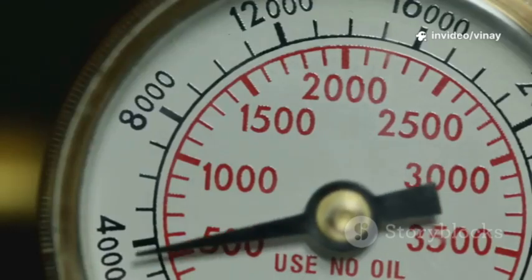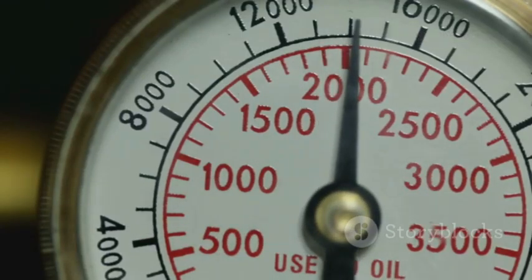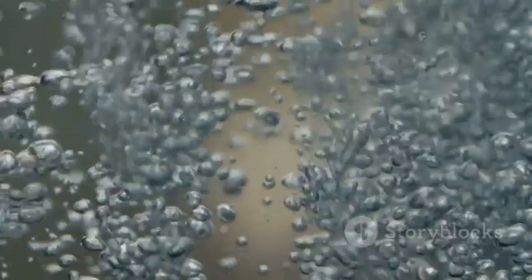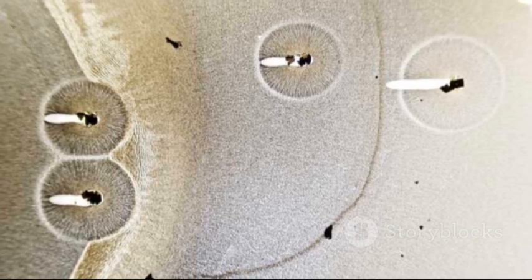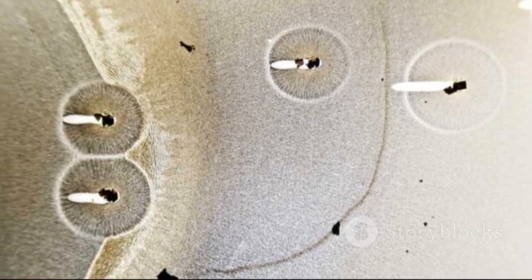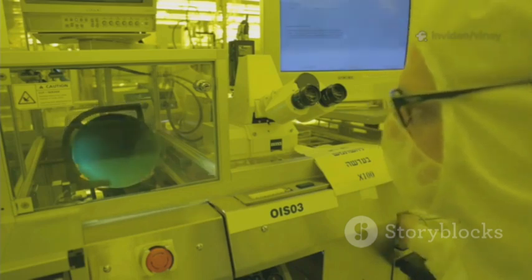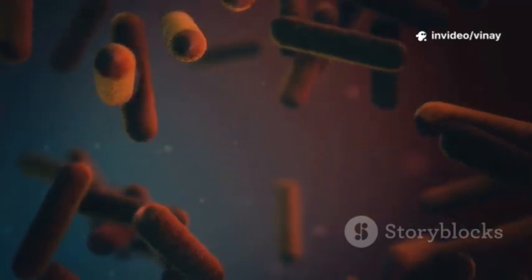If our test shows a bubble point of 52 psi, that's great. It means the largest pore is even smaller than the maximum allowed size, and the filter passes the test. But what if we see a steady stream of bubbles at a much lower pressure, say 30 psi? That's a bad sign. A low bubble point tells us that there is at least one pore in the filter that is too big. It could be a small tear, a manufacturing defect, or some other kind of damage. That oversized pore is a potential pathway for bacteria to get through.